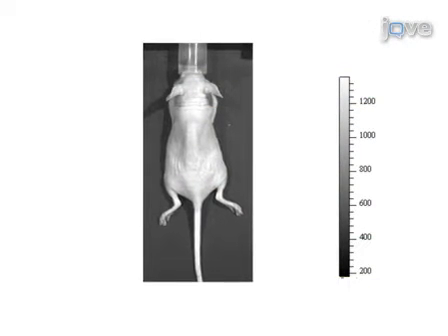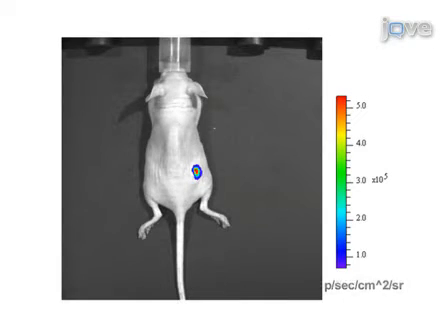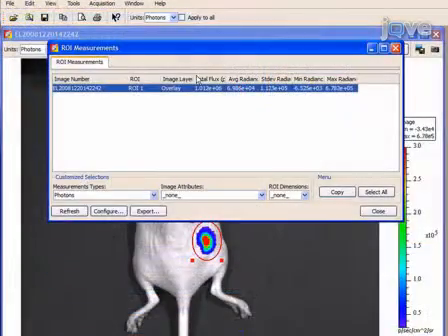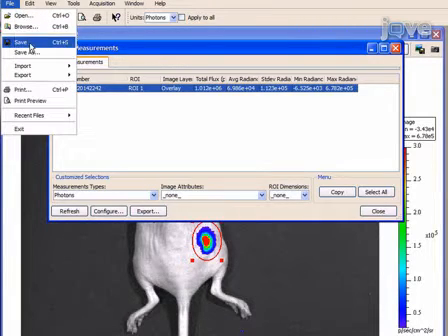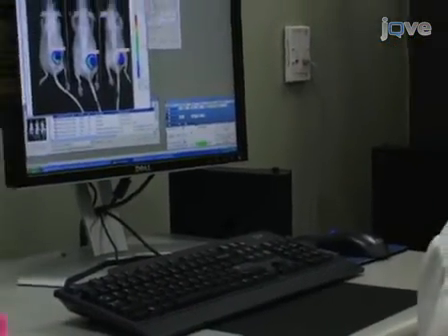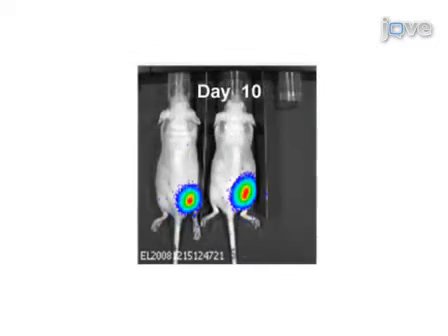IVIS acquires a photographic image of the animal under white light, and a quantitative bioluminescent or fluorescent signal is overlaid on the image. The bioluminescent signal is expressed in photons per second and displayed as an intensity map. The image display is adjusted to provide optimal contrast and resolution without affecting quantitation. Luminescence from the cells can be measured at the site of injection using a region of interest tool. Measurement data are displayed in a table together with all experimental parameters relating to image capture, which can be saved or exported for analysis. Multiple images can be acquired and compared in longitudinal studies covering seconds or months. We will measure photon flux from the tumor at time zero and monitor for four weeks with imaging at bi-weekly intervals.